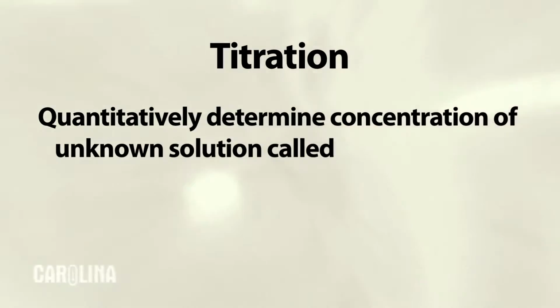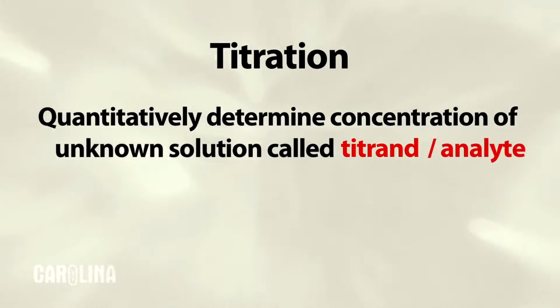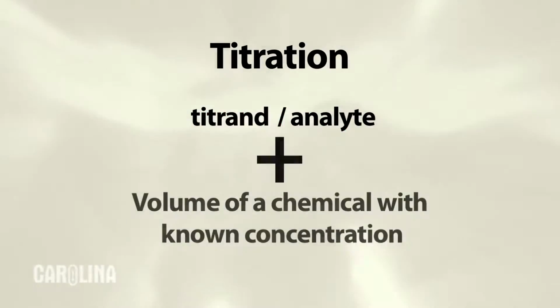Today, we will be discussing the proper titration technique using the complete single burette assembly kit available from Carolina Biological Supply Company. This is the first in a two-part video series on titration. The purpose of a titration is to quantitatively determine the concentration of an unknown solution, commonly called the titrand or analyte, by adding a volume of a chemical with a known concentration called the titrant. To mark the endpoint of a titration, an indicator is added to the analyte.